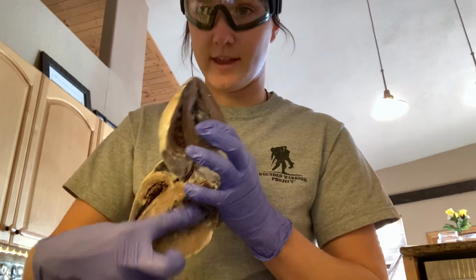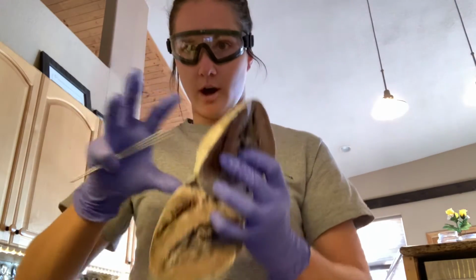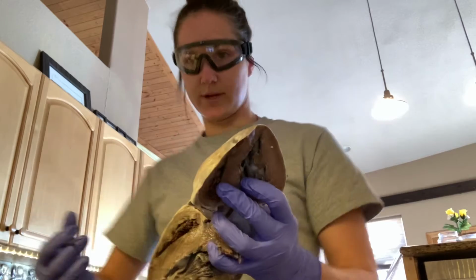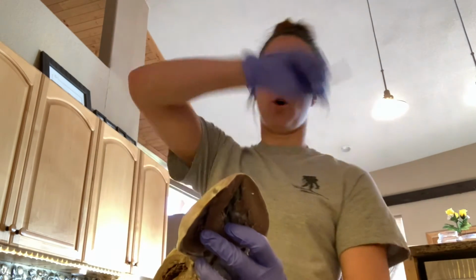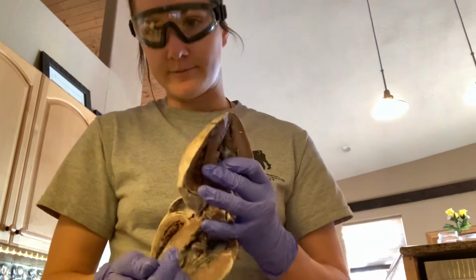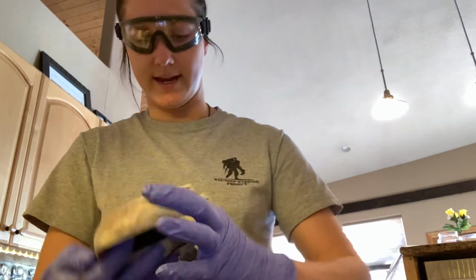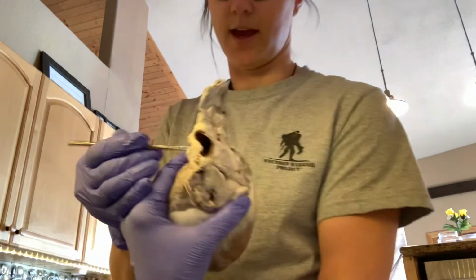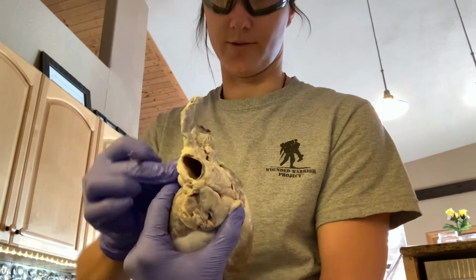Now, down here, this big portion here, that's the left ventricle. Like we said, it's the biggest of the 4 chambers. And the reason is because we have to get all that heart muscle to squeeze and pump all the blood throughout the rest of our body. And the left ventricle shoots out through the aortic valve, which then ends up in the aorta, which is this big giant tube here.